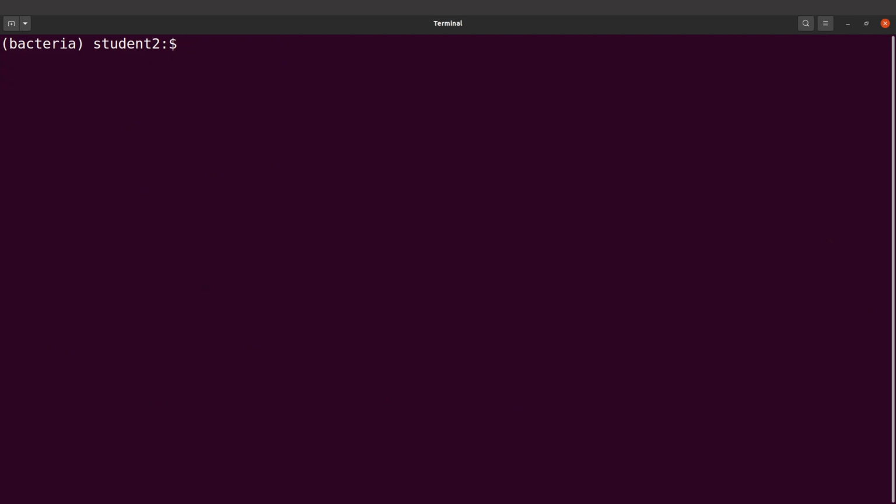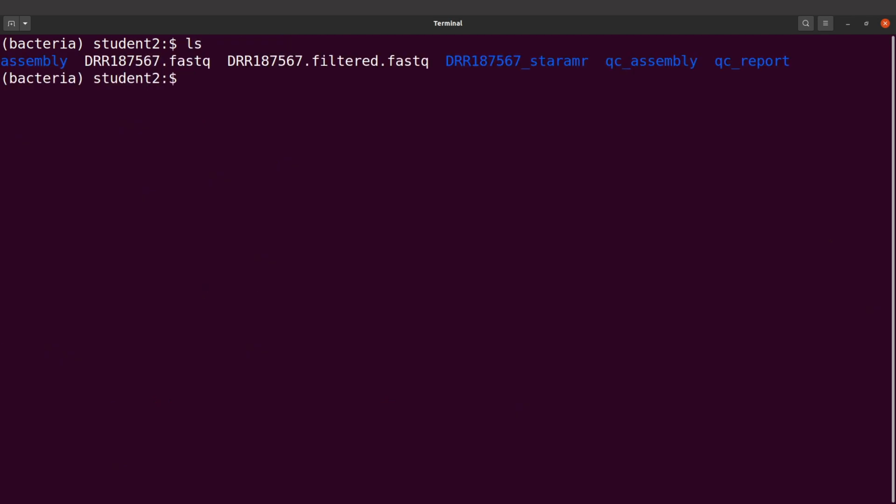Now, before I rerun STARAMR, I will have to remove this directory because I'll use the same name. So I'll say rm -fr, and then I'll remove it.